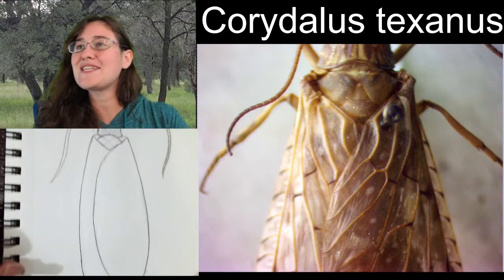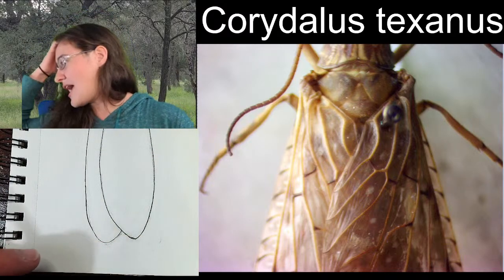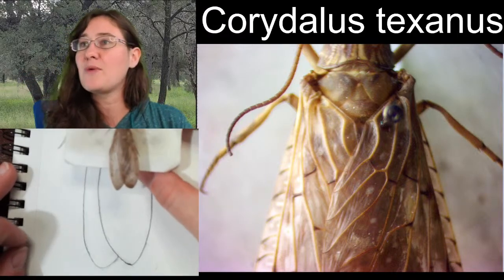All right, check out those wings. The wings do not match evenly, and in my experience, Dobsonfly wings don't.